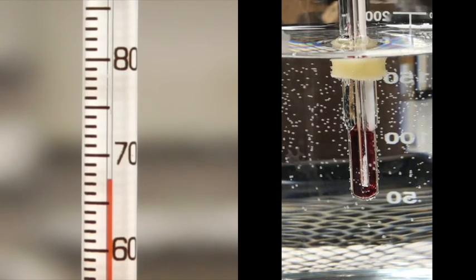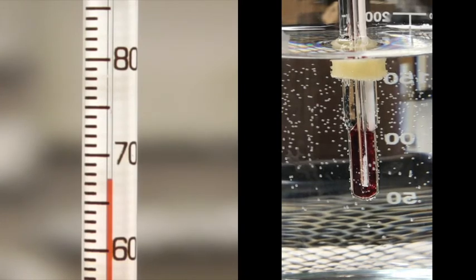So we're moving up to about 67.5. Might have to heat it a little bit, so I'm going to put the heat back on there just a little bit. See if we can push that temperature up a little bit. I'm going to take it out. Didn't do much. Let's do that again.